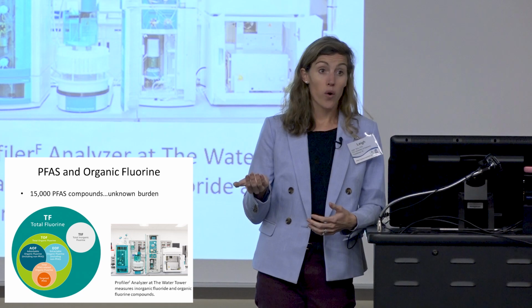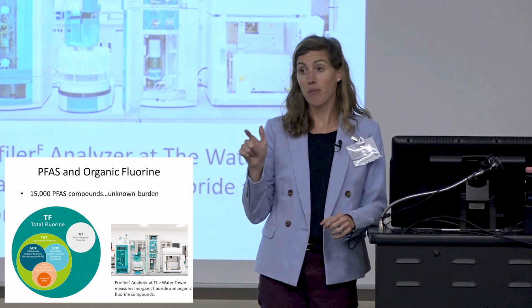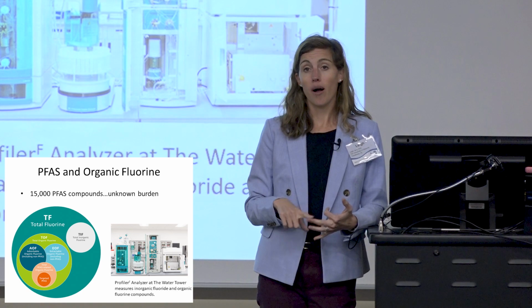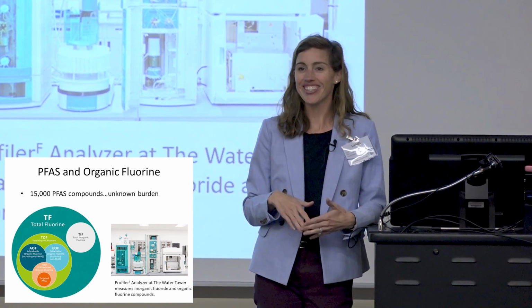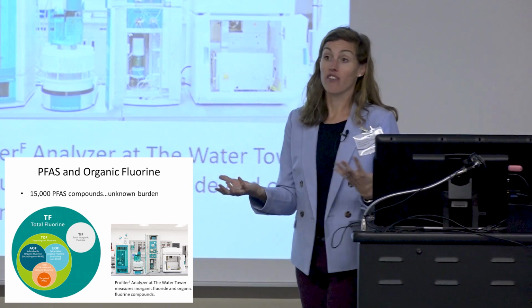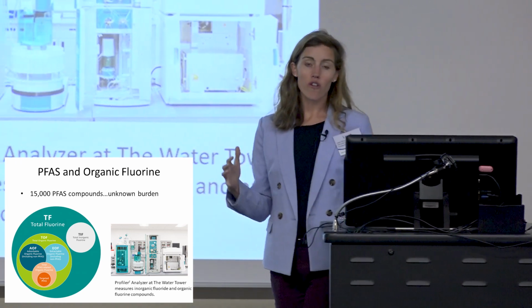The methods for detecting those 6 PFAS, you have to use an instrument called an LC-MS, a liquid chromatography mass spec. It's very expensive, very time consuming, hard to analyze. PFAS leaches from everything, it's in everything, it sticks to everything. So these instruments and the methods are very complex. And you can't detect all of them. So we're gonna look at a total fluorine.